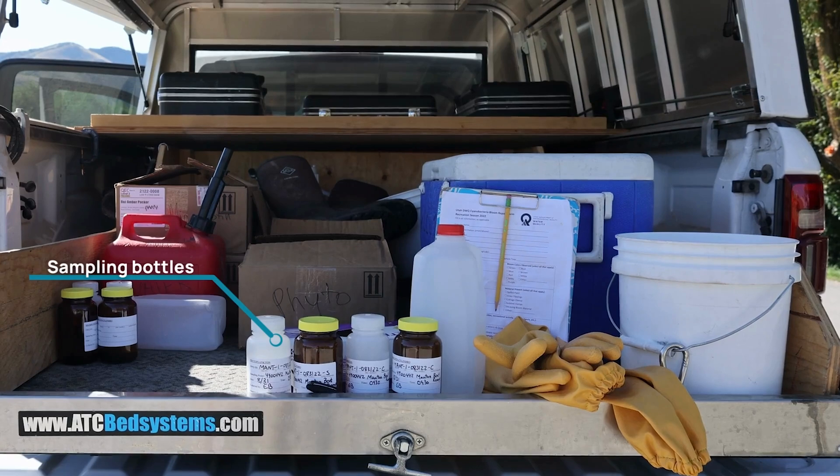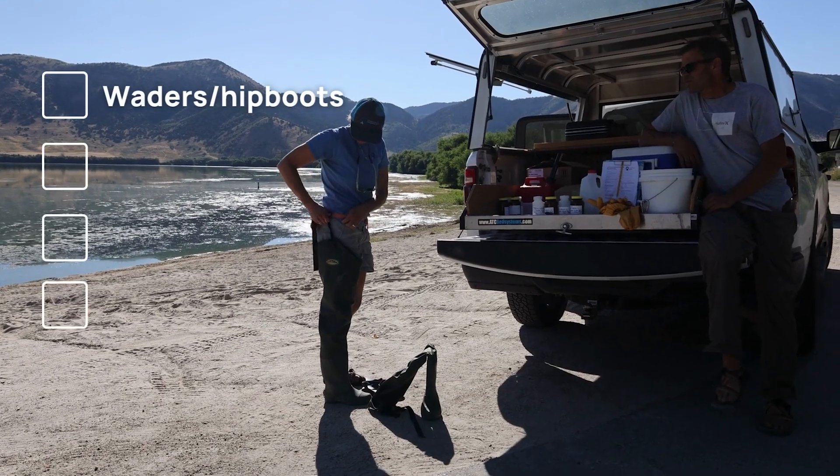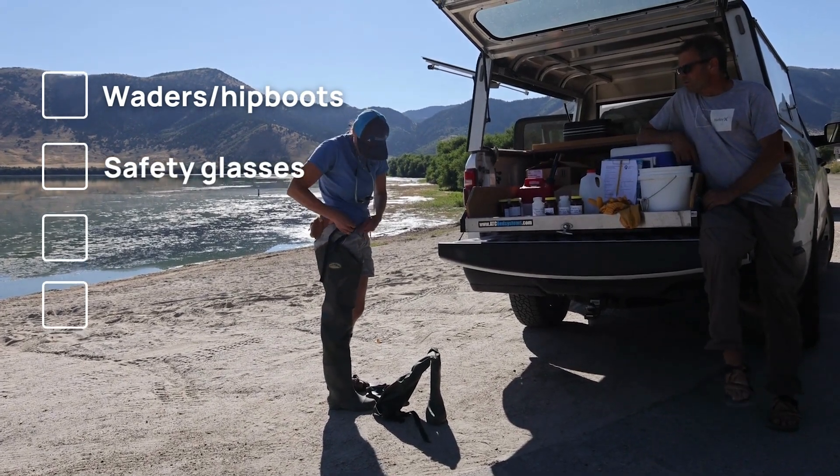To sample for HABs, you will need sampling bottles, a half-gallon transfer bottle, a bucket, your data sheet, waders or hip boots, safety glasses, and elbow-length gloves.